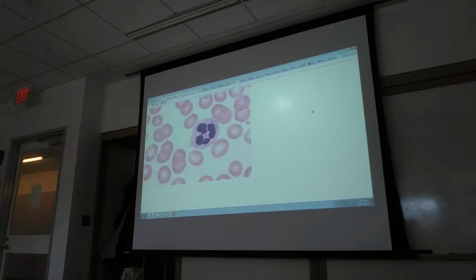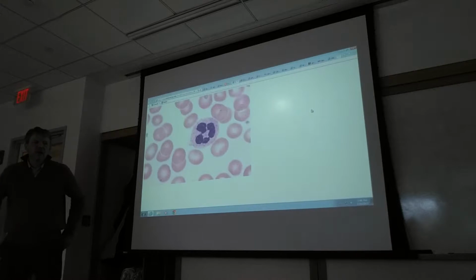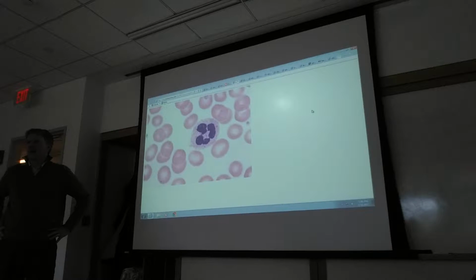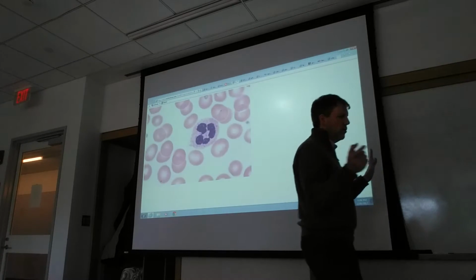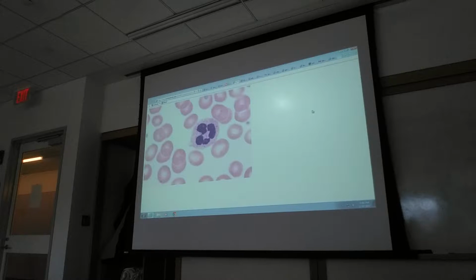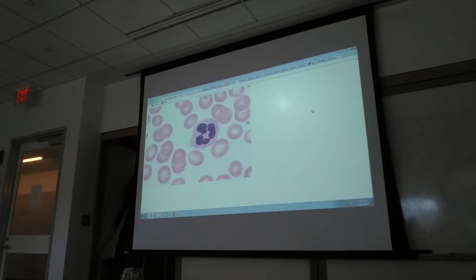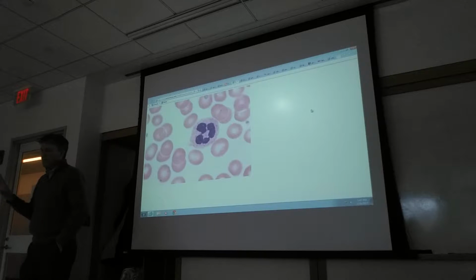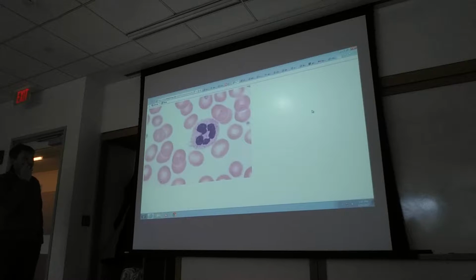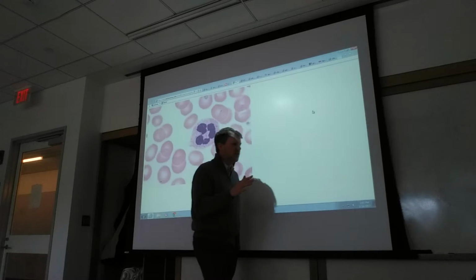Okay, so let me talk about the white blood cells, since those are the ones that are going to give you trouble. For those of you that listened to the lecture, how many types of white blood cells are there? 5. There's 5 types, okay? There's something called neutrophils, eosinophils, basophils, lymphocytes, and monocytes, okay? And your job is going to be able to differentiate the 5 from each other. And I'd say it's fairly easy, but there's one that's somewhat tricky for students.